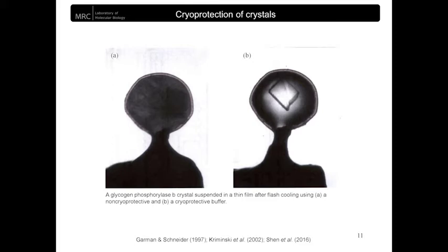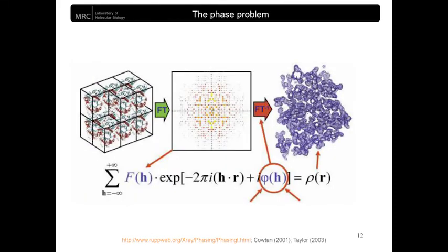However, crystal quality can be lost also because of the late integration of a reagent in the condition, and the additional handling of crystals required for soaking experiments. After data collection, the phase problem often means failure to solve a novel structure, since there are no known homologues to apply the molecular replacement method.